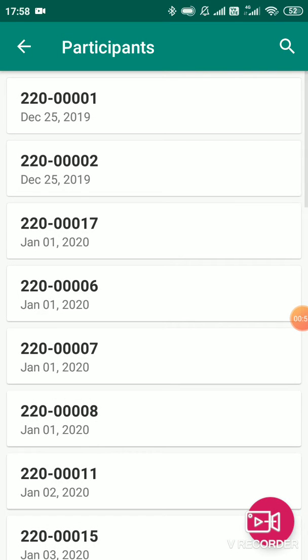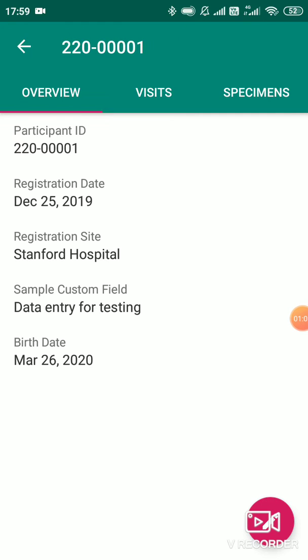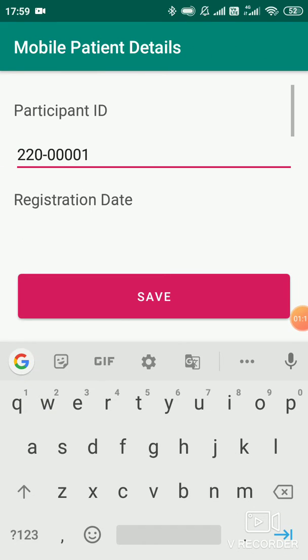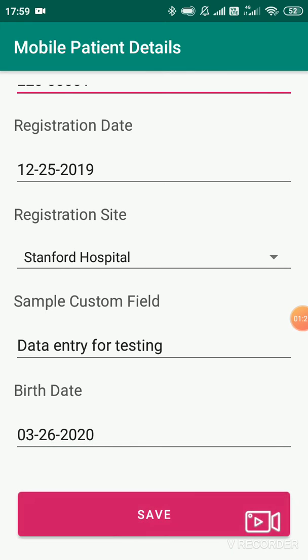I'll show you the current participant. As you can see here, there is a participant ID 220-00001. You can edit the data entry once you're done by clicking on the red icon on the right-hand end. Whatever you want to edit, you can edit here and just click on save.